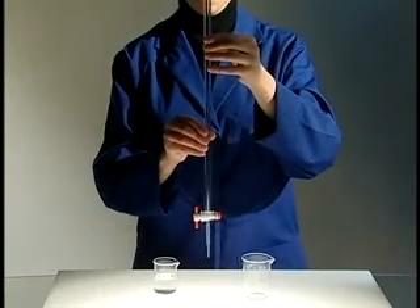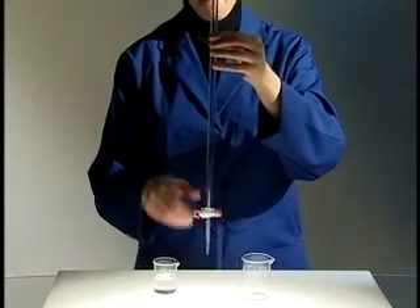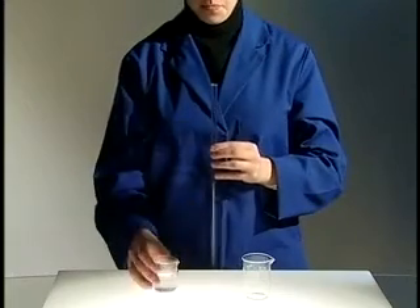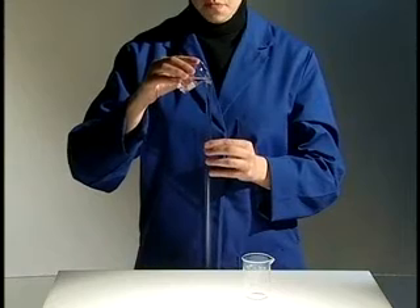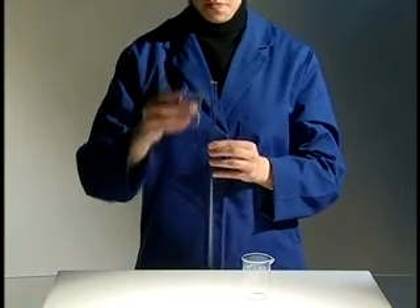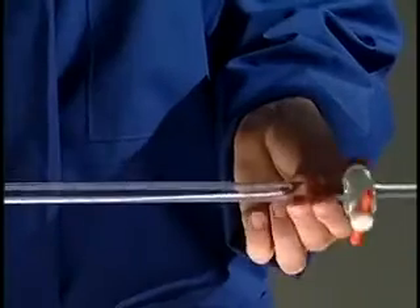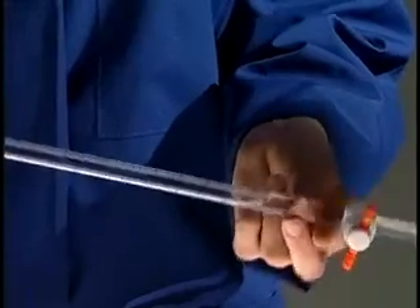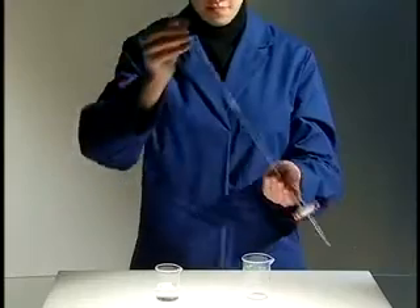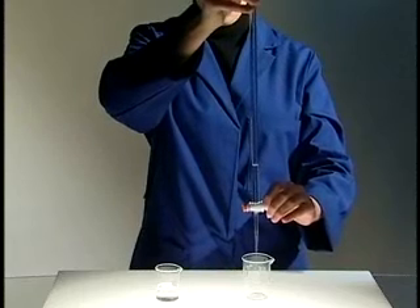Before filling a burette, it is important to first rinse the burette with the solution you will be using. Make sure the stopcock is closed and fill the burette approximately one-tenth full with the solution. Hold the burette horizontally between your fingers and slowly rotate to ensure complete rinsing of the sides. Return the burette to an upright position and allow the solution to drain through the tip.